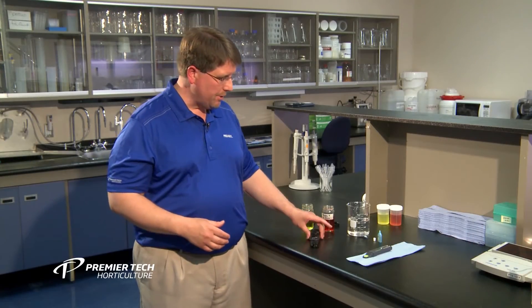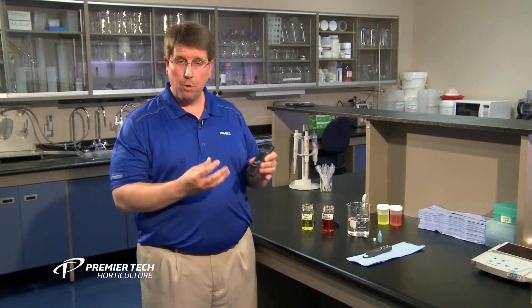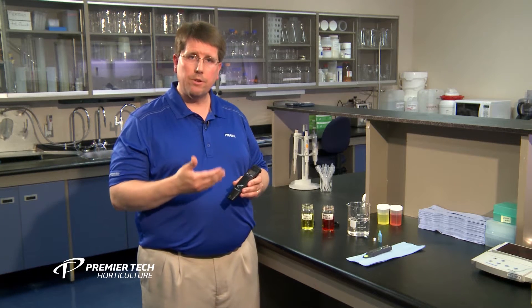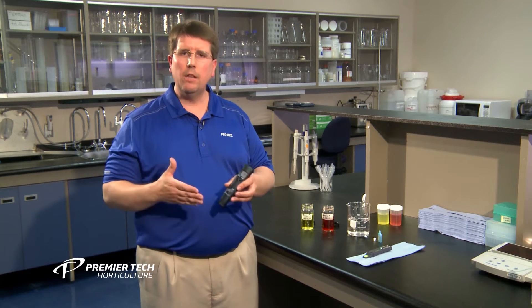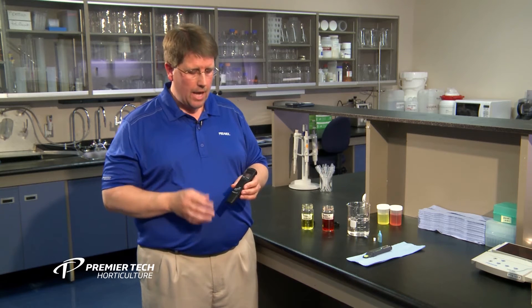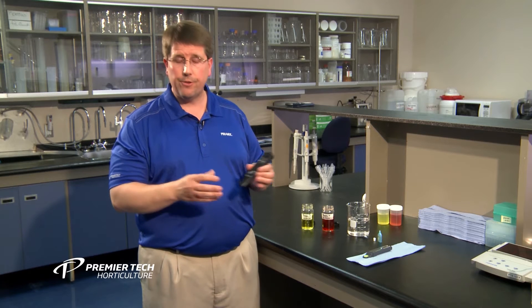With pH meters, I have one represented here. There are a couple of things you want to look for when purchasing a pH meter. Number one, you want to get something that requires calibration. Any meter that does not require calibration has a tendency to drift over time and lose accuracy — if you can't calibrate it, you don't know how inaccurate the reading may be. This particular one has a glass probe on the end. With glass probes, you have to store them in storage solutions, so they need to be stored wet — just a thing to consider.